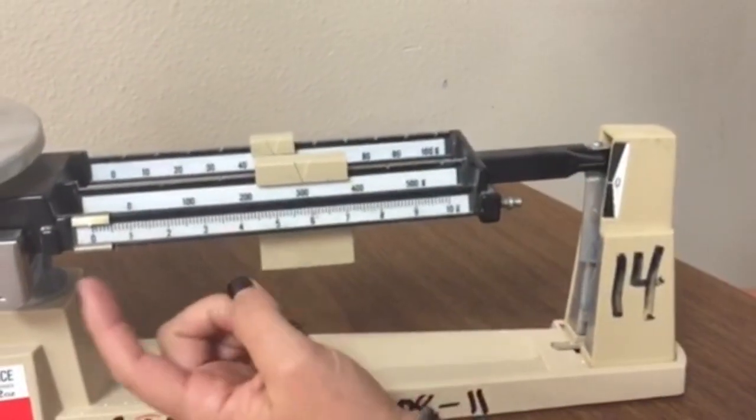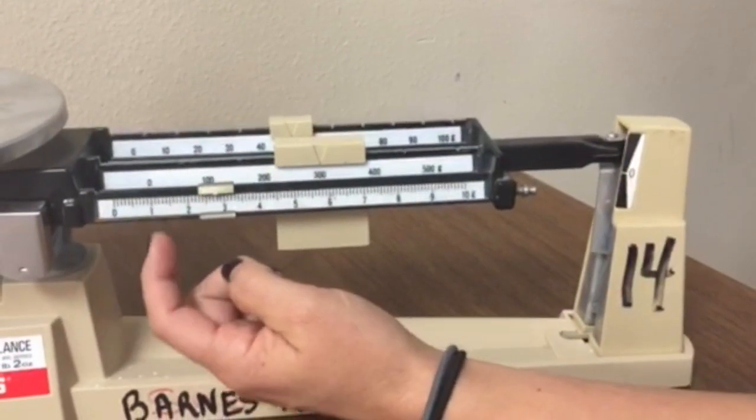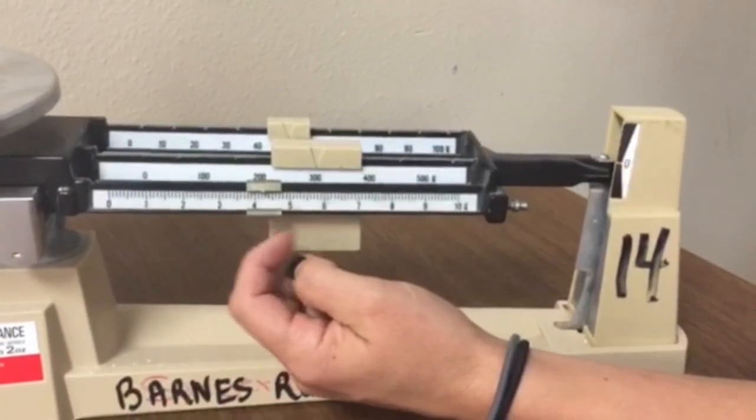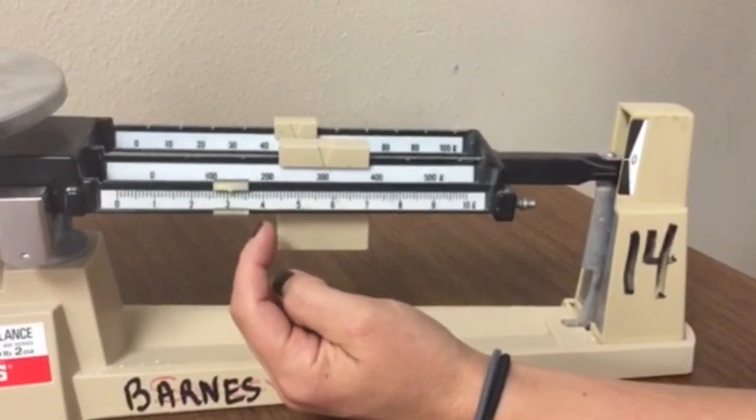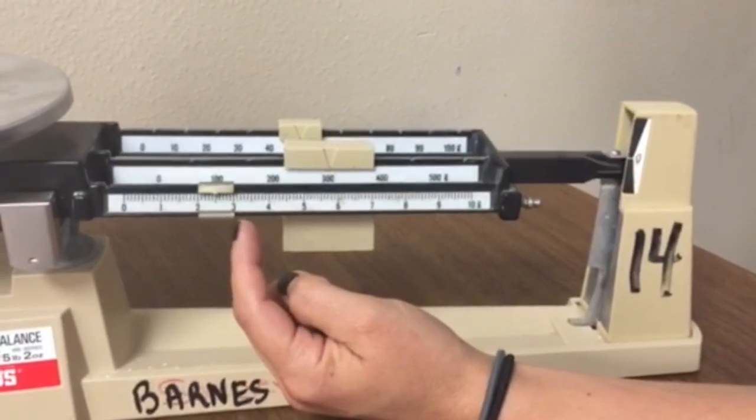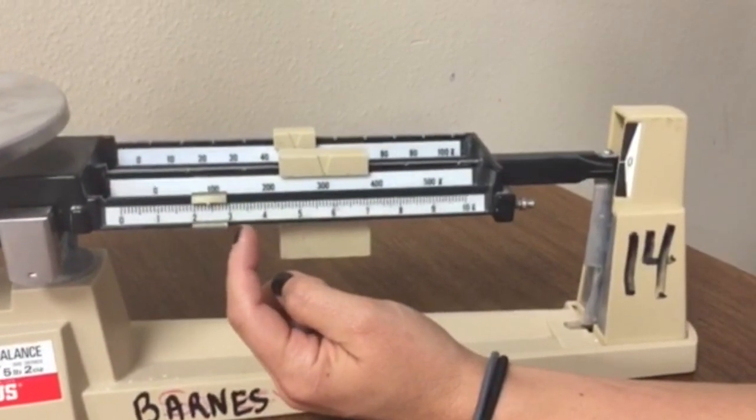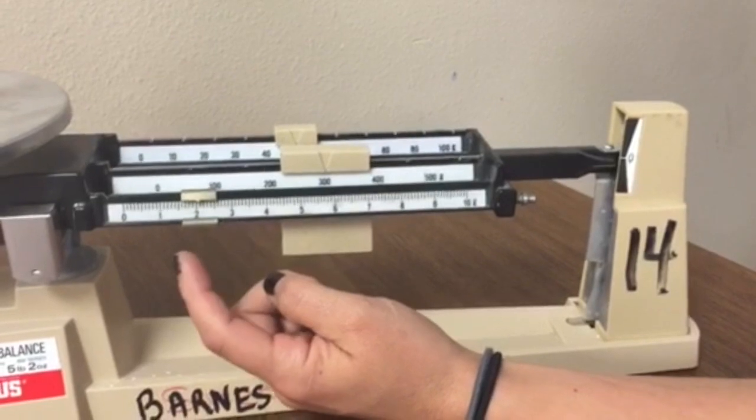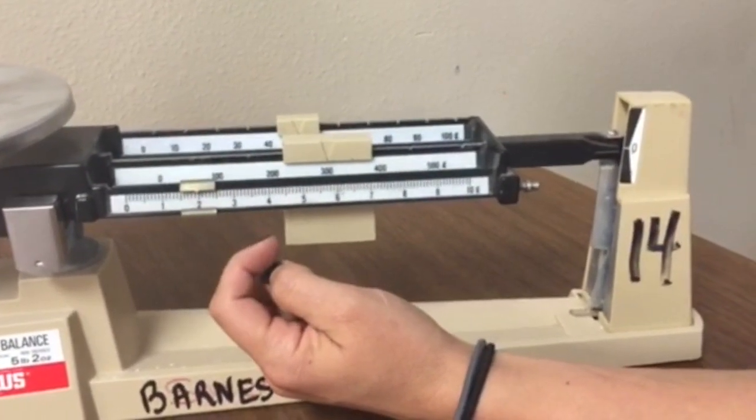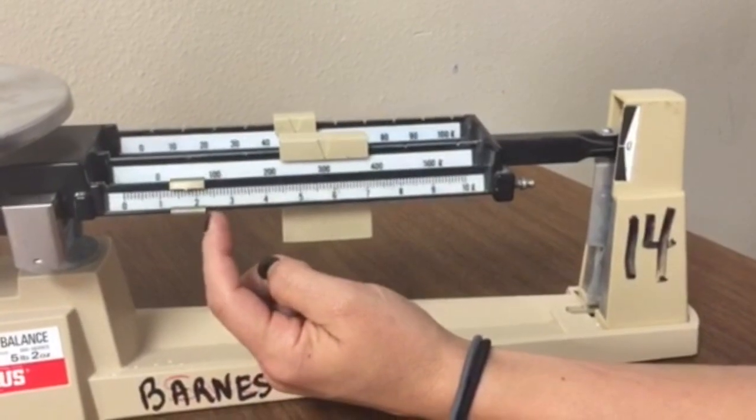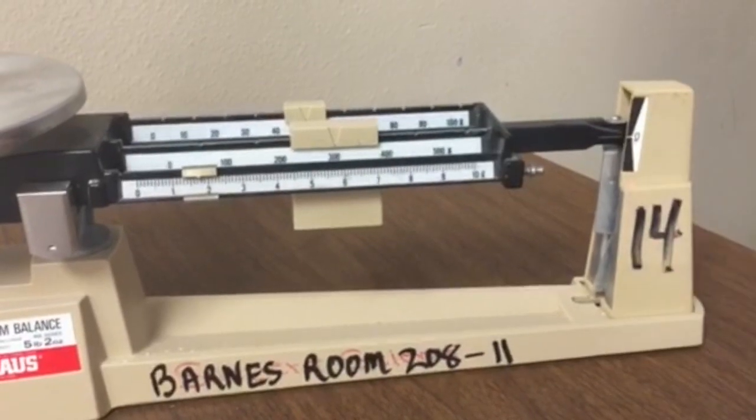Now I'm going to go to my ones and all the way to the tenths. Still too much, a little too much, so I'm going to make sure that it's balanced in the middle. Okay. So there it is, balanced in the middle.